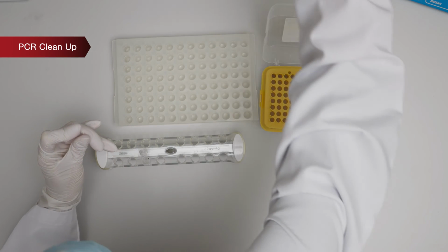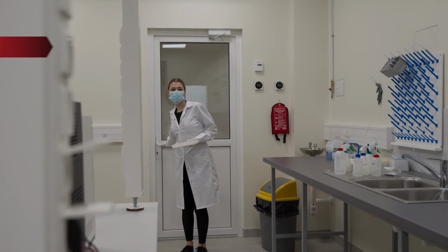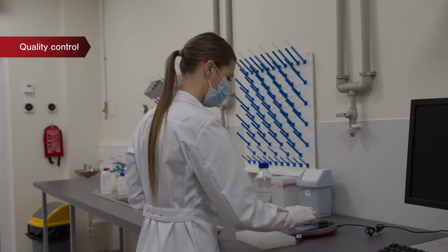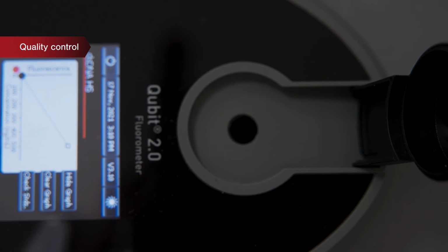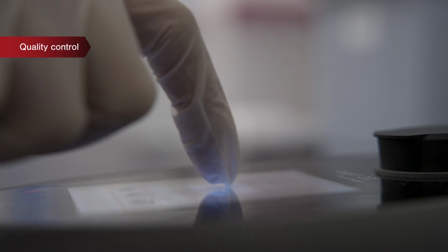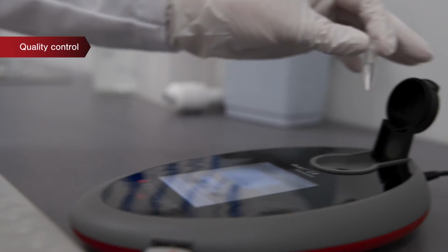The quality of these samples is determined by quantifying the purified enzymatic digestion product with Qubit and single-stranded DNA assay kit. The ratio between the final enzymatic digestion products and input products of PCR should be more than or equal to 7%. So if the sample input was 50 nanograms, then the single-stranded DNA concentration should be at least 3.5 nanograms in 1 microliter.